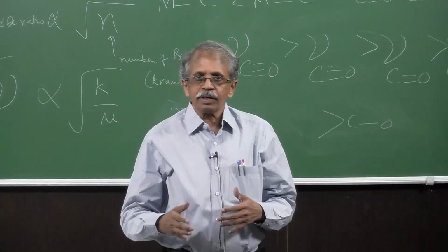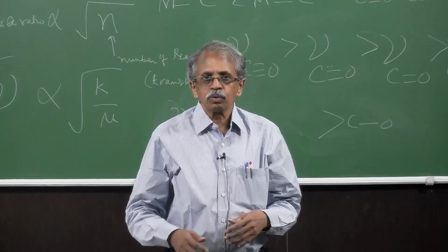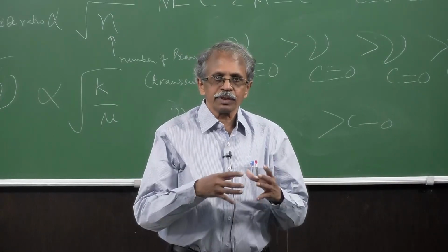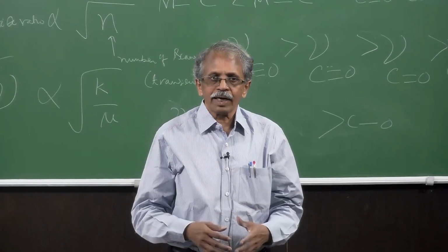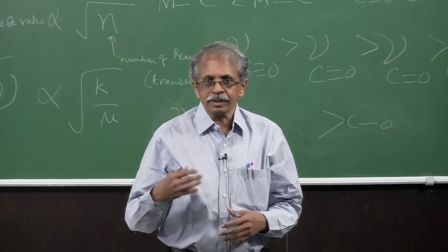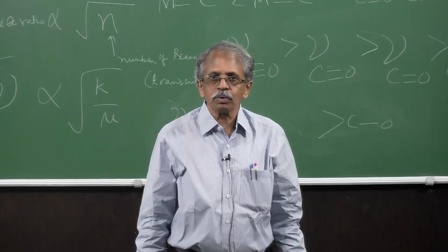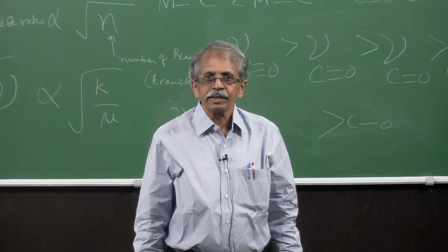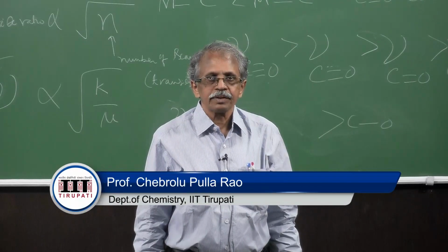We have a little more travel to go, maybe a couple more classes, looking at different examples and comparing spectra using infrared as well as Raman, and together. Then for inorganic coordination complexes, inorganic species, nanoparticles, nanocomposites, and bioinorganic examples, all these we will be looking at in the couple more classes coming up before we close the vibrational spectroscopy topic. Thank you very much.